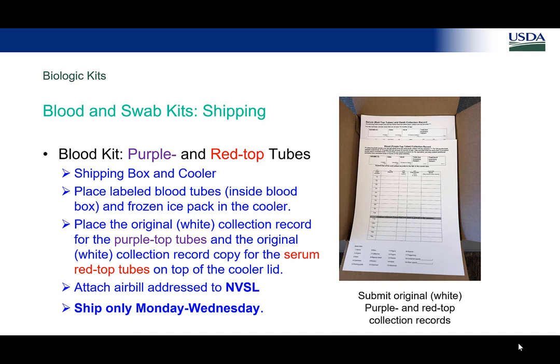Silly question, is the little rubber sheet bag something in a new SOP, or is this different because it's not a program disease box? We just like to put lots of bags around things. Usually you'd use biohazard bags, but we don't have biohazard bags. It's not an infectious disease, so we don't need to use them, but the labs like extra bags.